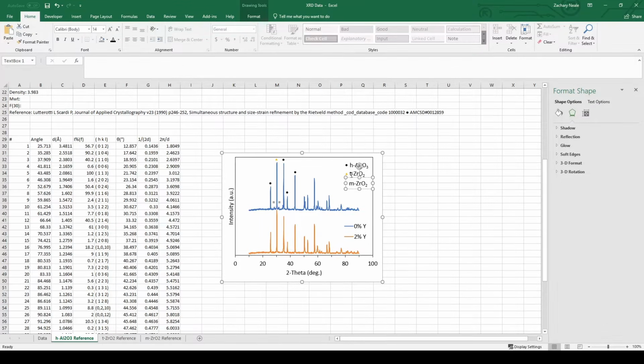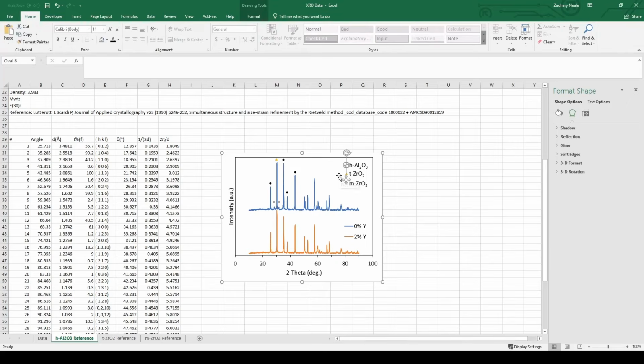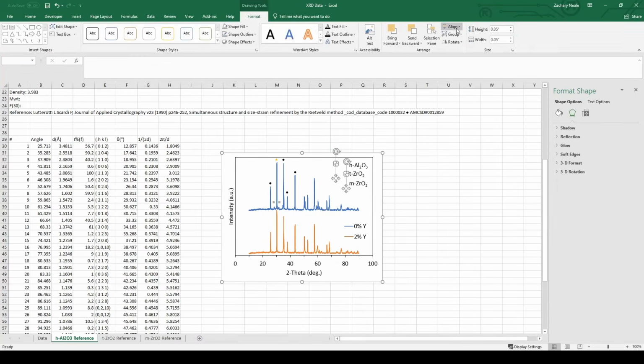You can align these text boxes if you go to Format. If you click on all three text boxes using the Shift key, and you can go to Align, say Align Left, and then they all align to the most left. Same with the figures. If we can grab them, you can go to Align, say Align Center, for example. Align to center.